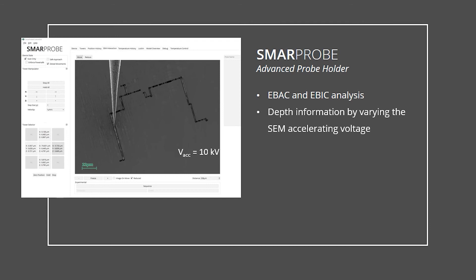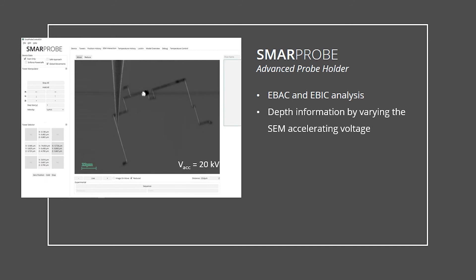By increasing the accelerating voltage of the SEM, the underlying connecting conductors become visible, and by further increasing it, an underlying PN junction becomes visible.